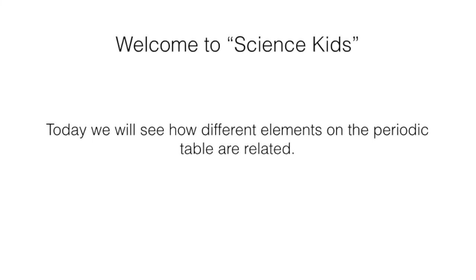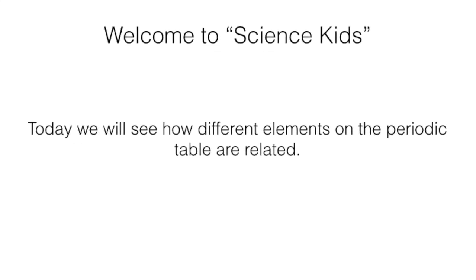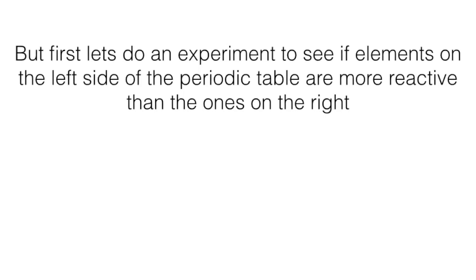Welcome to Science Kids. Today we will see how different elements on the periodic table are related. But first, let's do an experiment to see if elements on the left side of the periodic table are more reactive than the ones on the right.